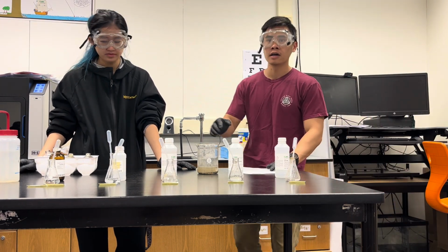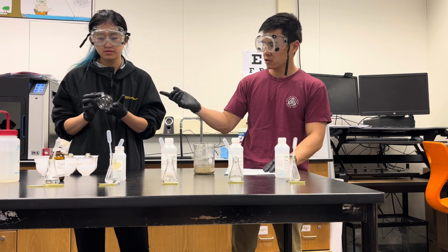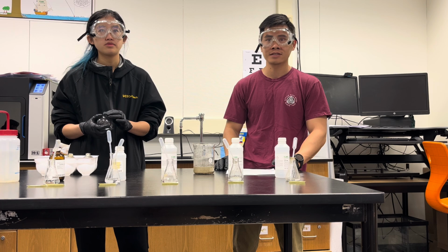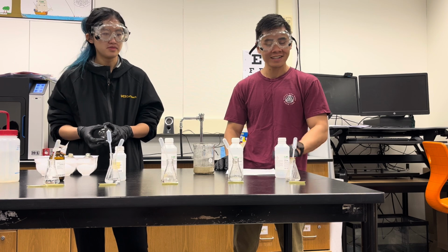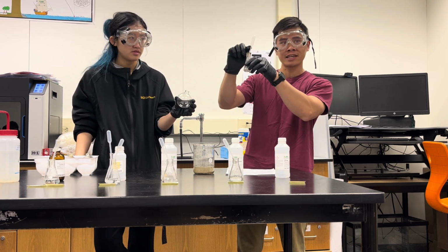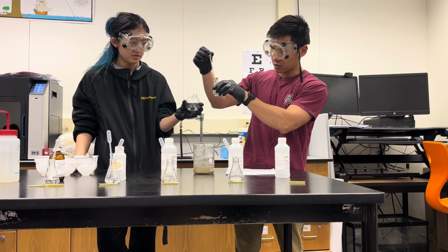All right, y'all. If you guys are watching, I'm assuming that's because you're ready to start today or you just need extra support. We have the glass ornament right here. You can see that it's perfectly clear glass. If you look at the procedures, does anybody know what the first step is? You pour the thing that starts with an A into the ornament. You're gonna take 2 mils, which is 2 pipettes up until this line on this 1 mil pipette, and put that into the glass ornament.